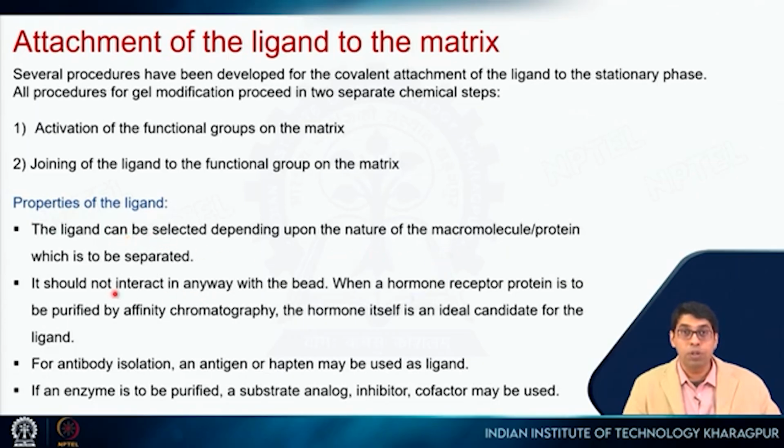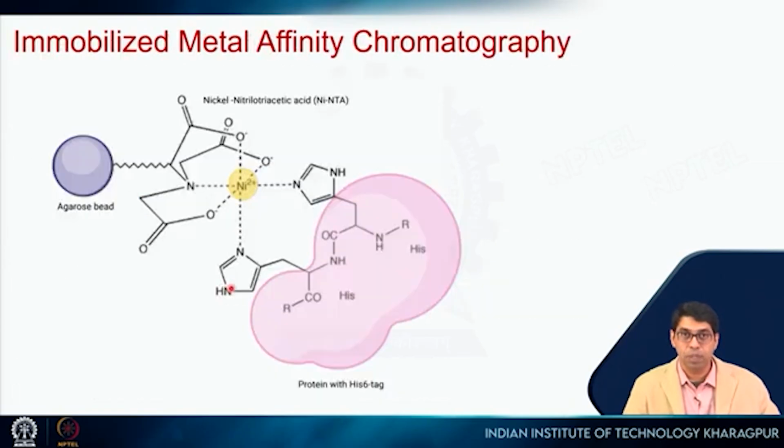Now the ligand should be selected depending on the macromolecular protein. It should not interact with the bead in any way, and you should be able to purify your protein. So break that interaction using some other common molecule.